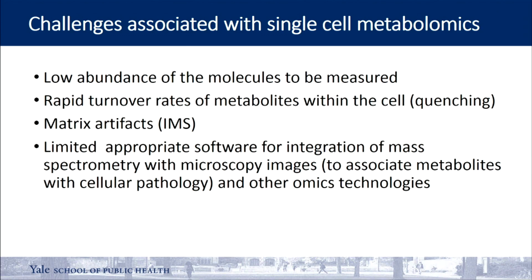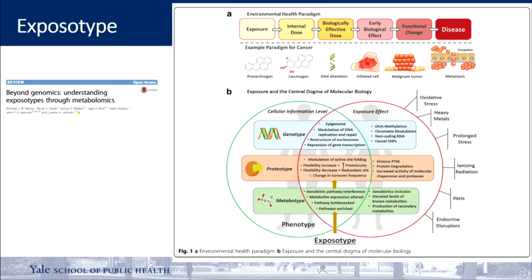This is why I have a few slides that I can go over with you in terms of artificial intelligence and what we're doing towards this approach. In addition to that, remember that we need more metabolome databases, we need more m/z data that we can use to identify more easily, instead of trying to use internal standards to get that.